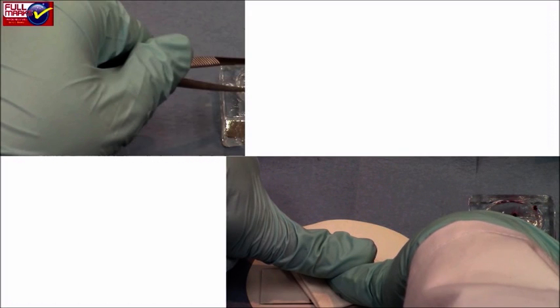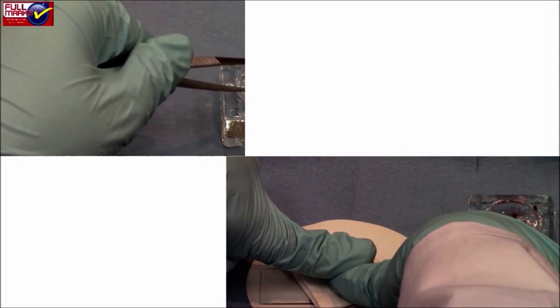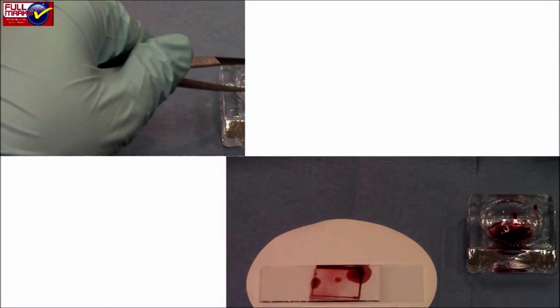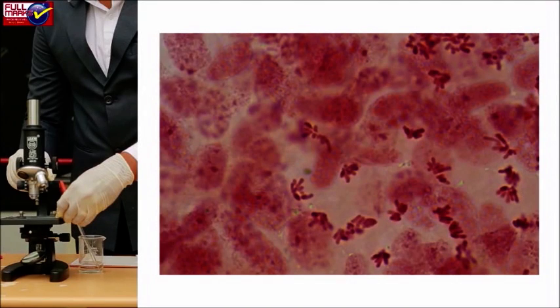Press the material with the tip of the finger and remove the excess stain which comes out of the side of the cover slip. Place the slide on the stage of the microscope and search for the dividing cells using lower magnification. When dividing cells were located, observe them under higher magnification.